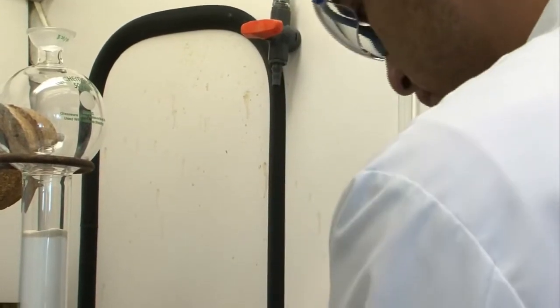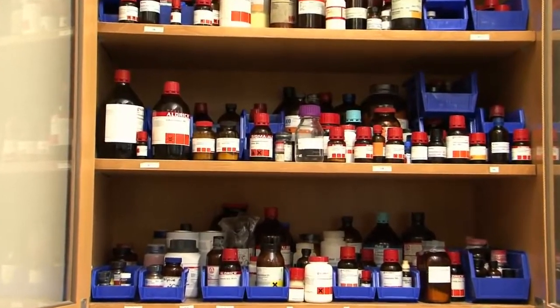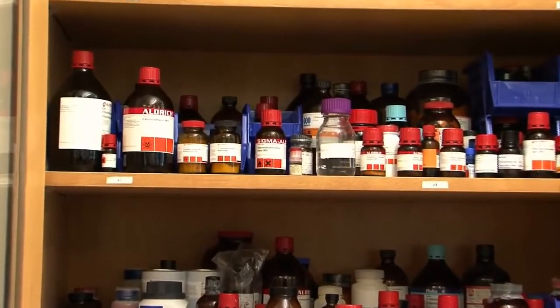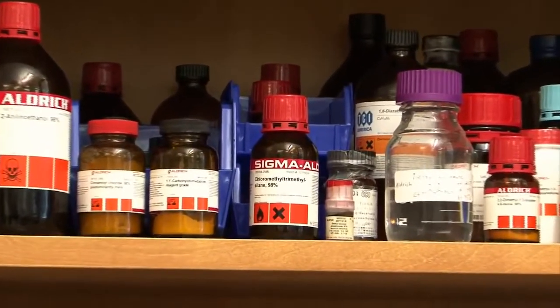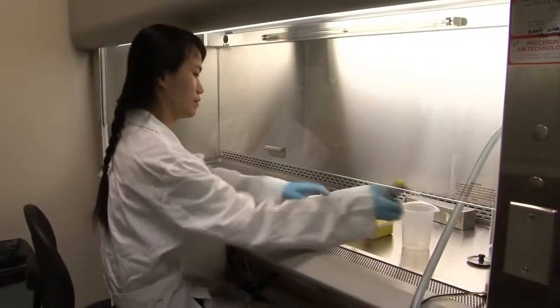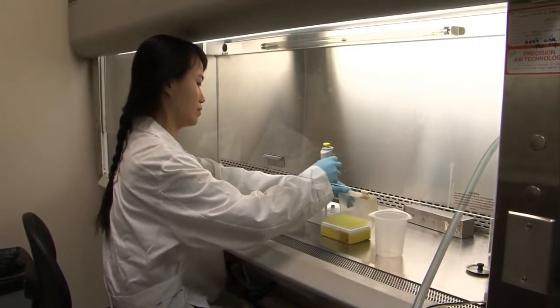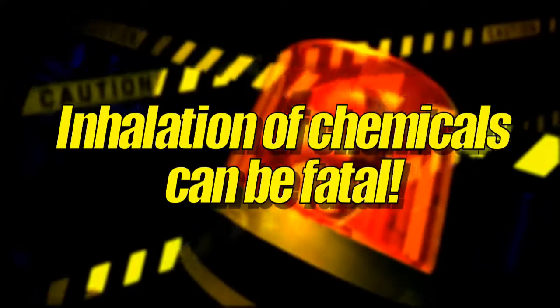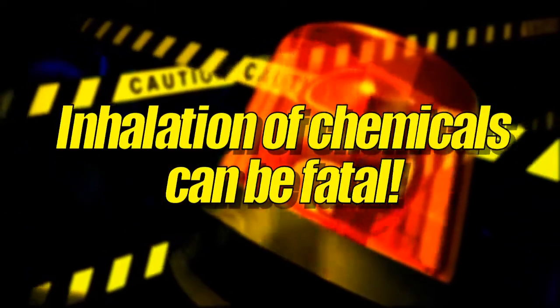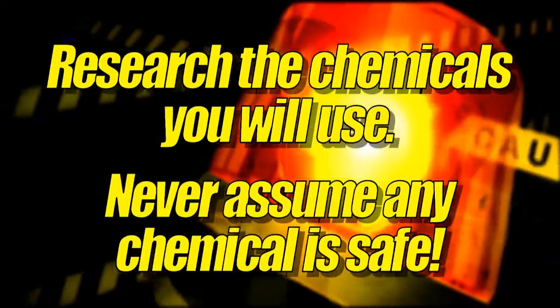Remember, when working with chemicals, you need to be aware of the hazards. In class, you learned that hydrofluoric acid is a weak acid. This often misleads many into thinking that it is a relatively safe chemical. However, this chemical is very dangerous and readily penetrates human skin, allowing it to destroy soft tissues and decalcify bone. Inhalation of hydrofluoric acid can even be fatal. So always research the chemicals you will be using and never assume that any chemical is safe.